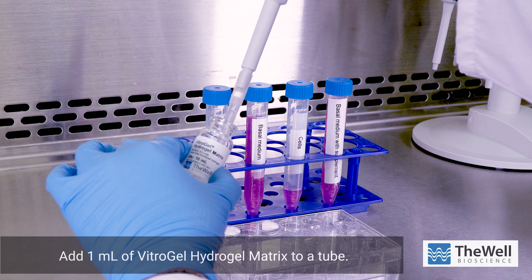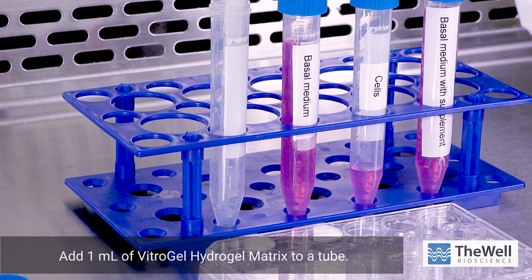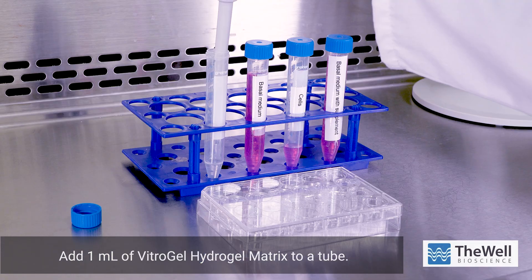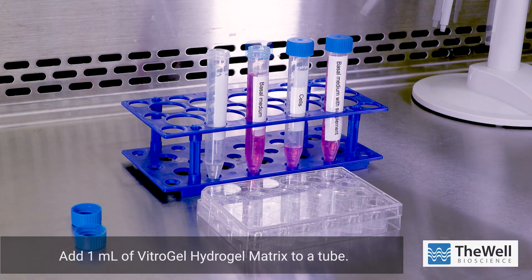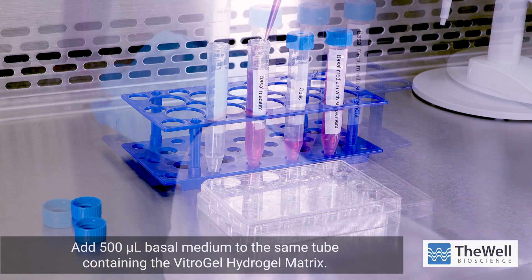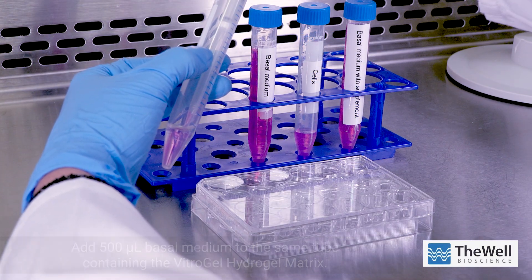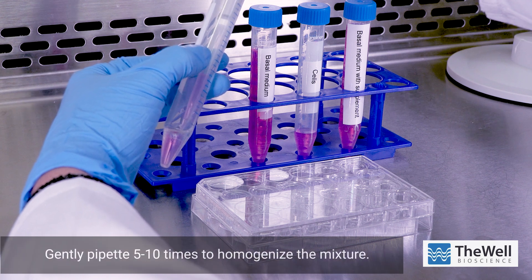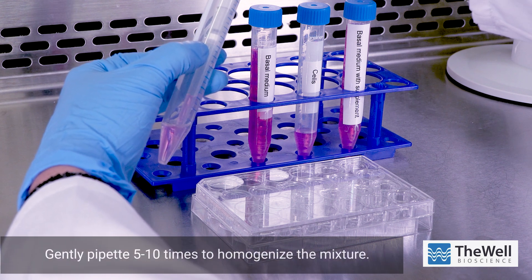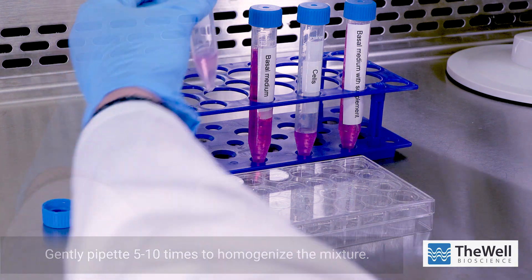Start by adding 1 milliliter of Vitrogel Hydrogel Matrix to a tube. Next, add 500 microliters of basal medium to the same tube containing the Vitrogel Hydrogel Matrix and gently pipette mix 5 to 10 times for a homogenous mixture. When planning the mixture, keep Vitrogel Hydrogel Solution and Basal Cell Culture Medium at a 2 to 1 mixing ratio.